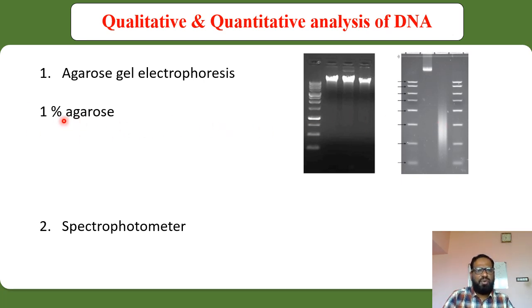Here we can see that if you take this particular diagram, we are going to discuss the quality of the DNA molecule. In this figure, this is one genomic DNA molecule, this is another genomic DNA molecule, and this is the third. Here you can see a discrete band, and it is present very, very near to the loading well. This is the loading well. These dark lines are nothing but the loading wells actually.